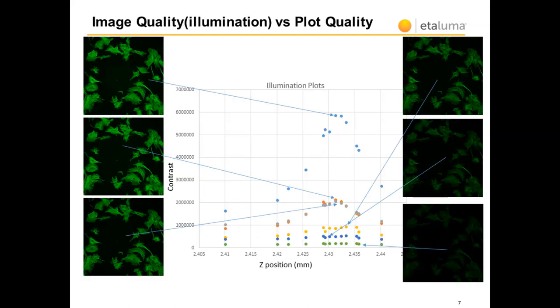Here are some real examples of image quality issues and their effect on the autofocus plot. As illumination is decreased, signal decreases, and so does the contrast plot.